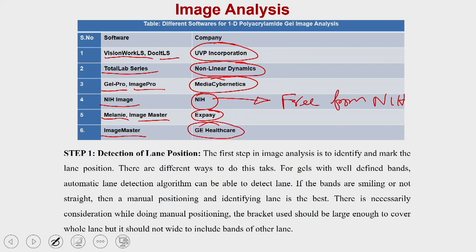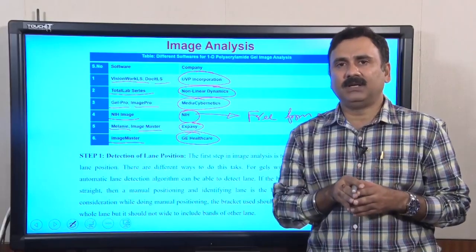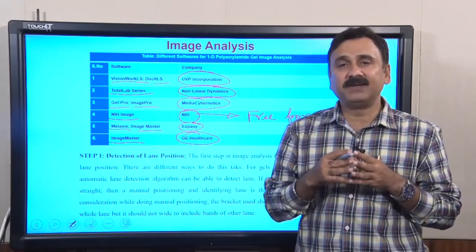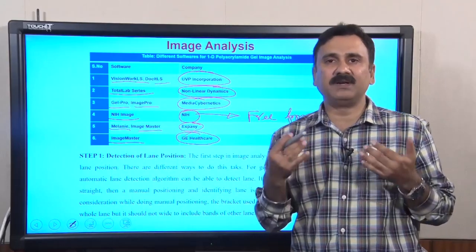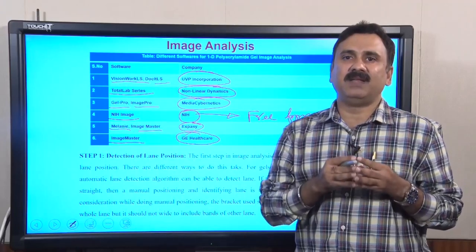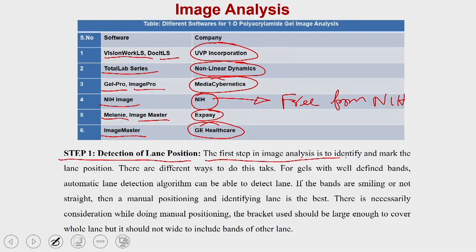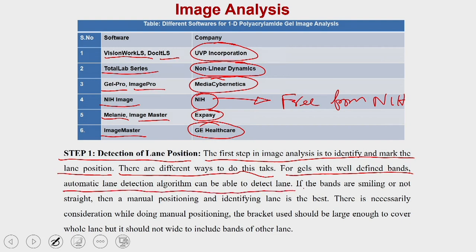So when you would like to analyze an image and deduce a lot of information, you have to follow definite steps. These steps could be different for different software, but the basic principle remains the same. In step one, you have to detect the lane position. The first step is to identify and mark the lane positions, which means you have to select the lanes, and there are different ways to do this. For gels with well-defined bands, an automatic lane detection algorithm can be used to detect a lane.